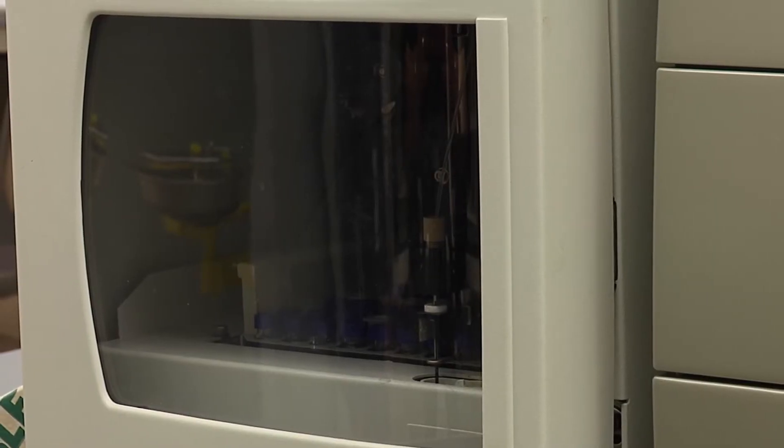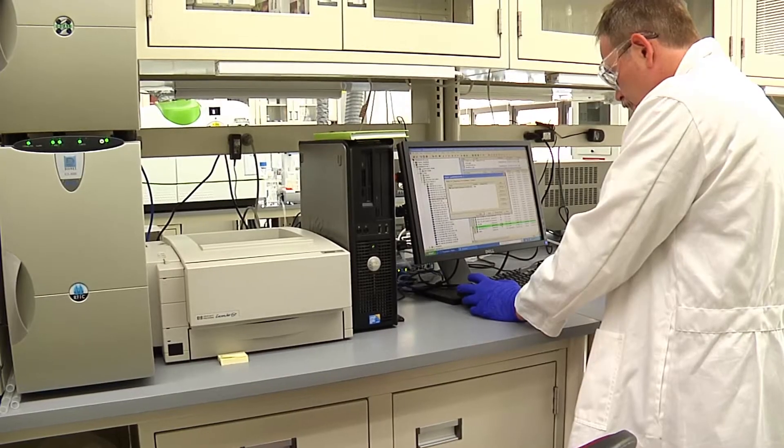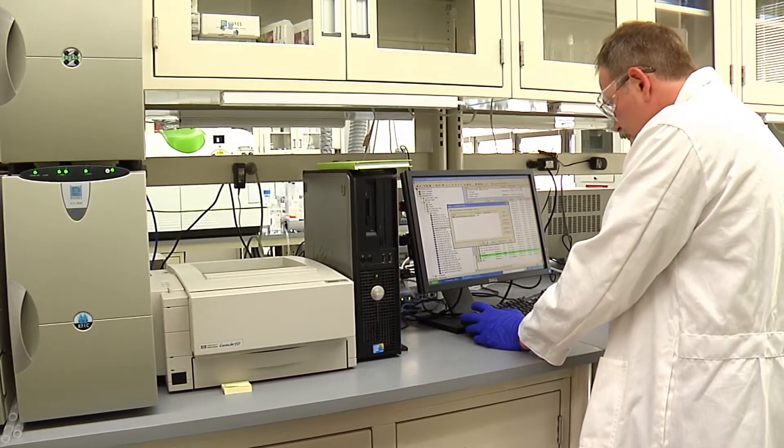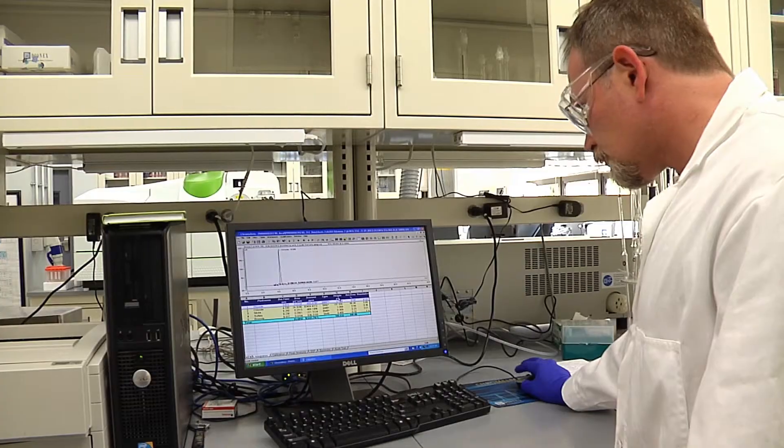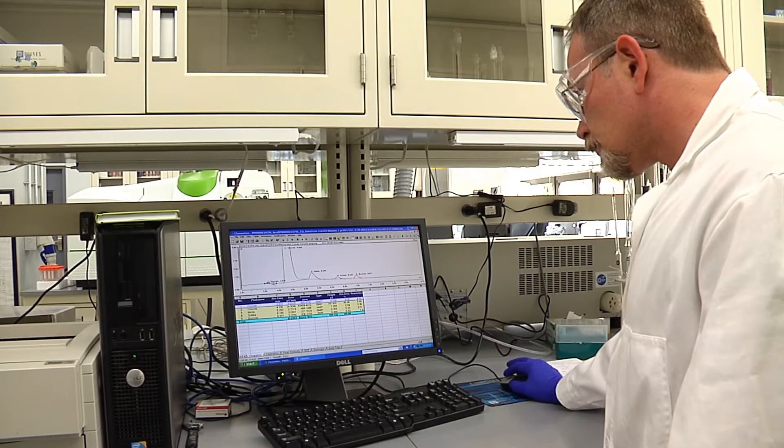Another method of analysis is ion chromatography, which is a process that allows the separation of ions and polar molecules based on their charge. It is often used in protein purification, water analysis, and quality control.